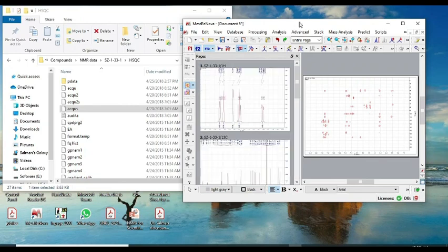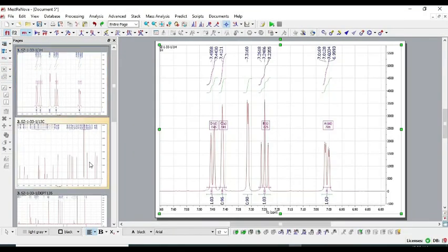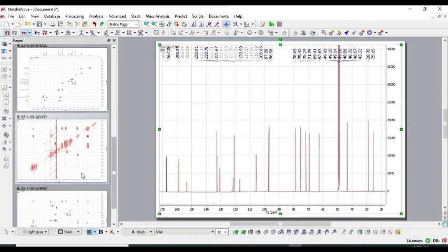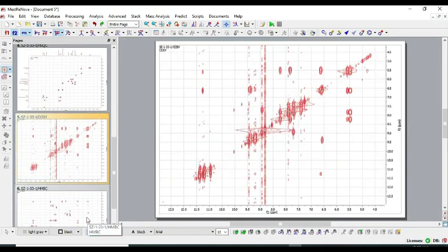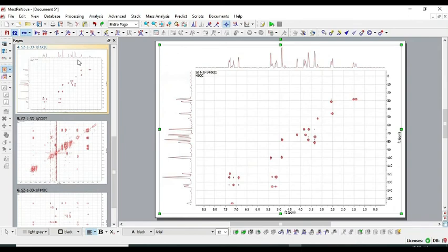You can extract maximum information about the structure of the molecule. We have not discussed the details of how to play with these COSY or HMBC or HSQC spectra. I'll tell you these details later on when we will be talking about these techniques in another course.